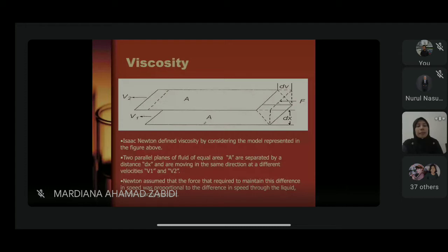So the liquid that is nearing your spindle, it will move according to the movement, to the direction of your spindle. Okay, contoh katalah you nak rotate clockwise. When you rotate clockwise, ini you all dah belajar inertia and momentum masa physics dulu. When the liquid is at rest, you start the spinning of the spindle, maksudnya you rotate spindle tu, some of the liquid will resist the movement. They will resist the direction of the movement for that particular spindle.